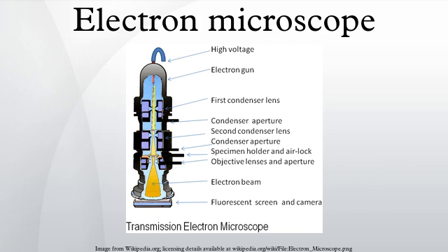The original form of electron microscope, the transmission electron microscope, uses a high-voltage electron beam to create an image. The electron beam is produced by an electron gun, commonly fitted with a tungsten filament cathode as the electron source. The electron beam is accelerated by an anode typically at plus 100 keV with respect to the cathode, focused by electrostatic and electromagnetic lenses, and transmitted through the specimen that is in part transparent to electrons and in part scatters them out of the beam.